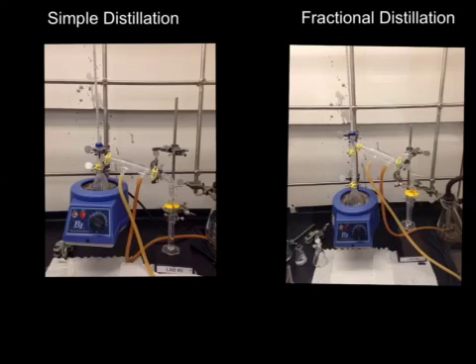The purpose of this experiment is to separate ethanol from a mixture containing both ethanol and water through the use of a simple distillation and a fractional distillation by comparison.